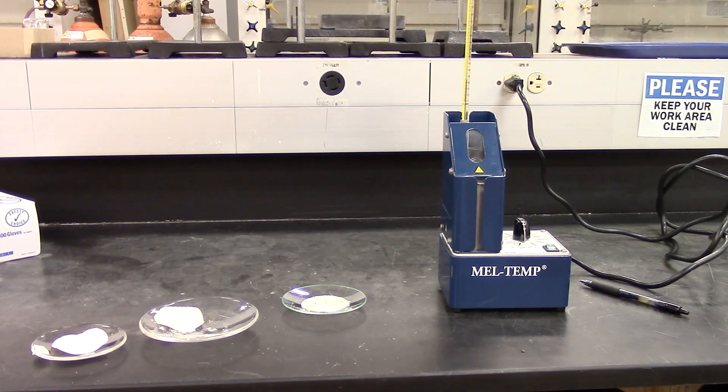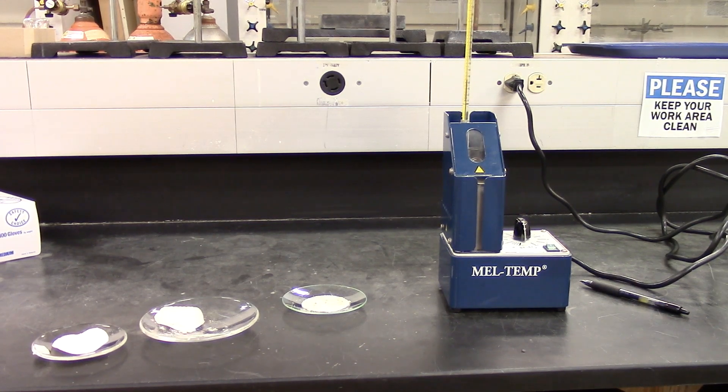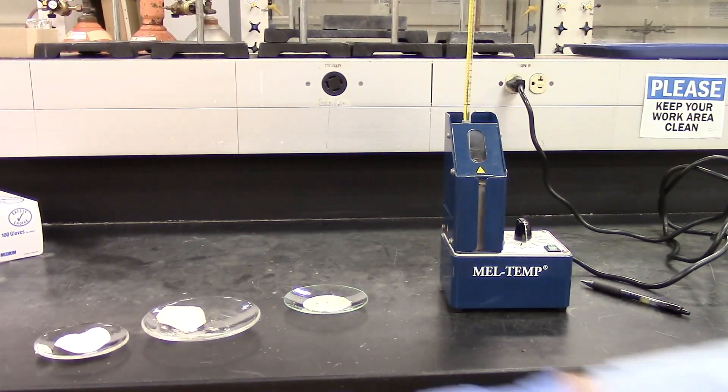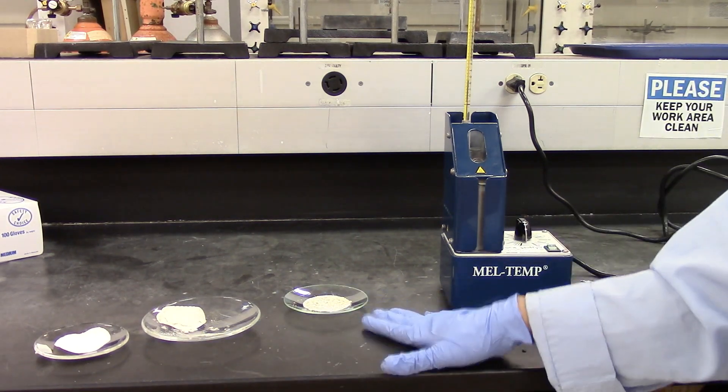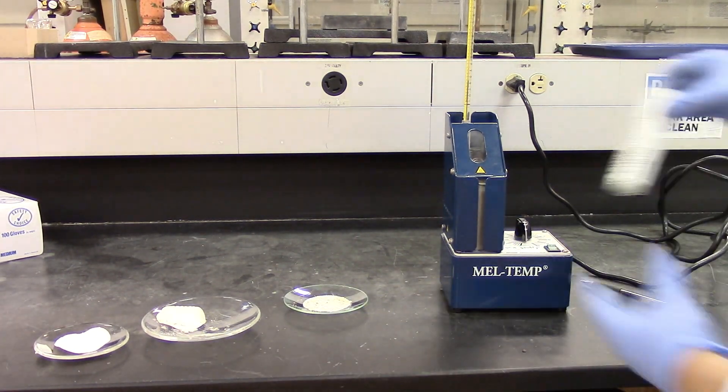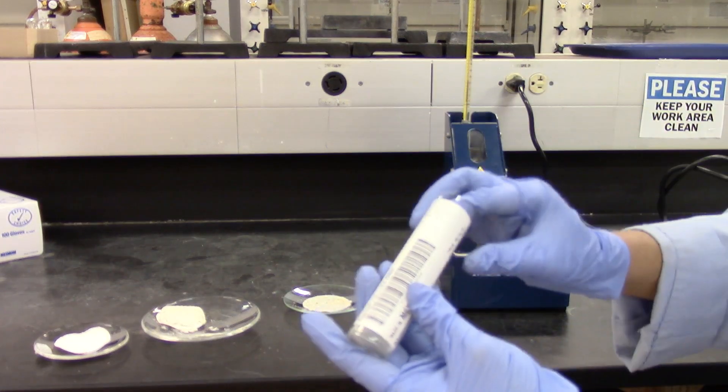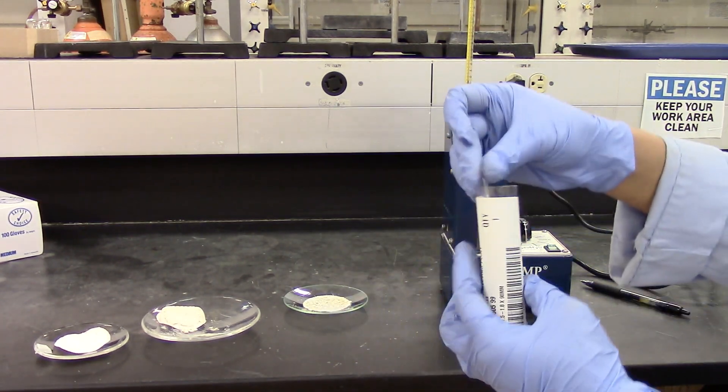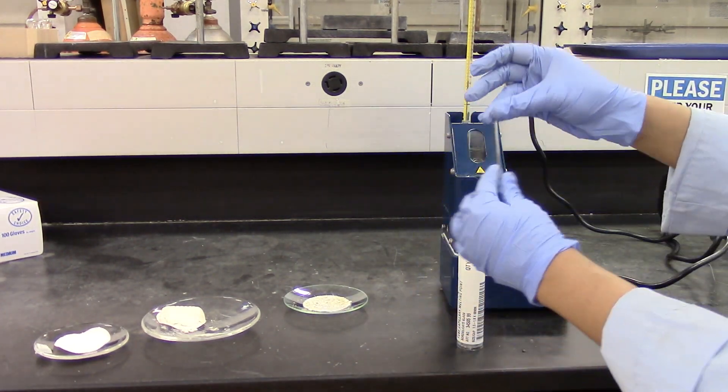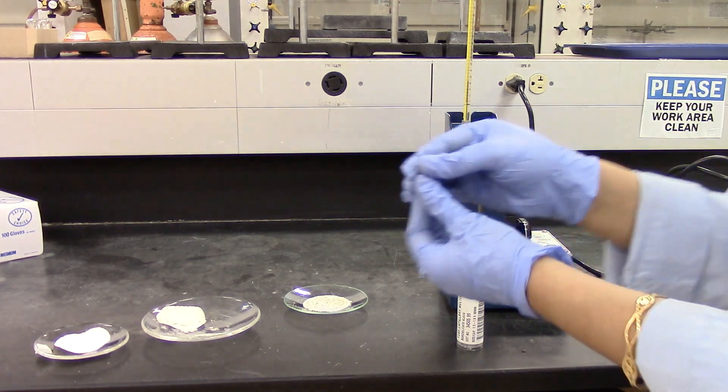So that's the melting point apparatus. And we have our three products: the aniline product, the acetanilide product and anisole product. I'm going to put some of the sample from each one into a melting point capillary. And the melting point capillary looks like this.